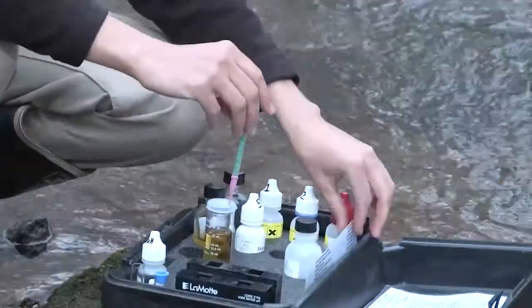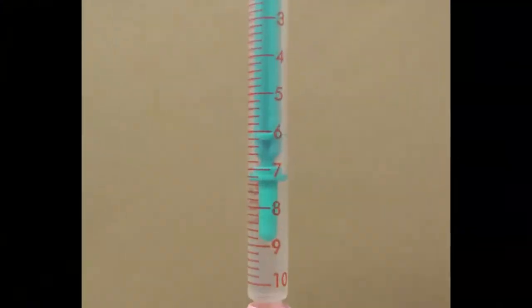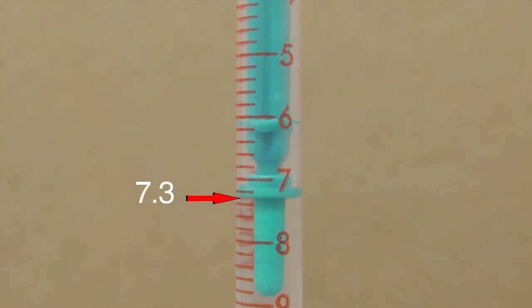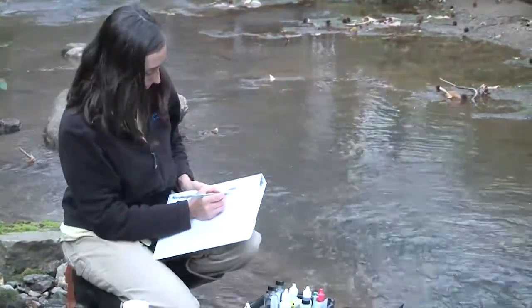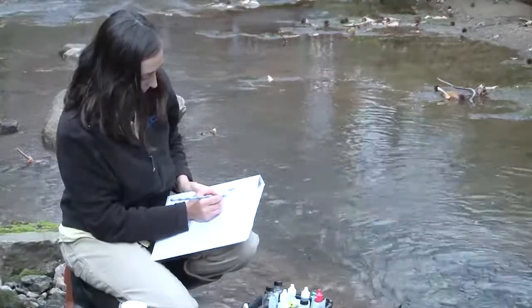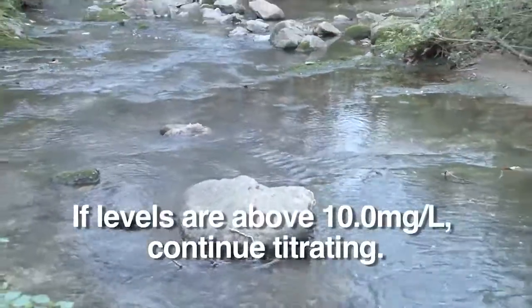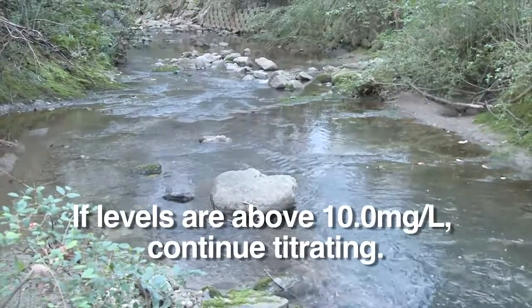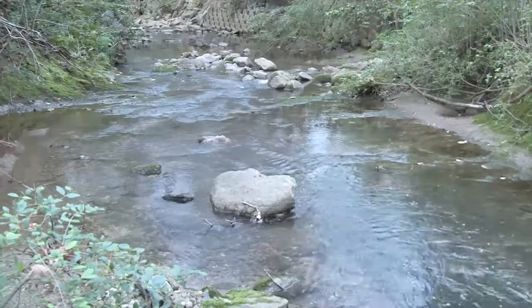Tara determines the amount of sodium thiosulfate used by reading the scale on the titrator. Each line indicates 0.2 milliliters. For this sample, 7.3 milliliters of solution was used. Because this is a direct reading titrator, this number directly correlates with the dissolved oxygen level, and it's recorded on the form as milligrams per liter, or parts per million. Tara records 7.3 as her result. If you encounter DO levels above 10.0, you will need to refill the titrator with more sodium thiosulfate and continue titrating until you reach the end point. Add the two quantities for your result.